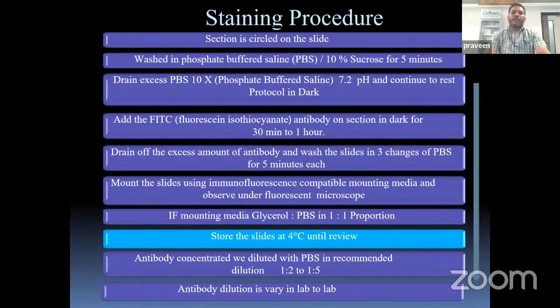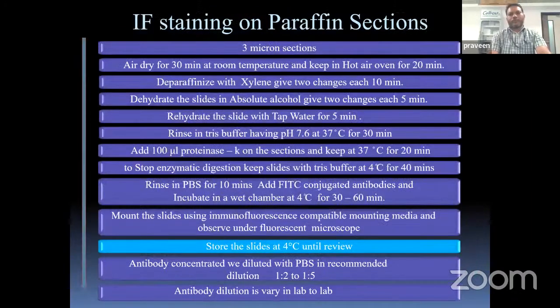Antibody is diluted with PBS in the recommended dilution provided by our vendor. Antibody dilution varies from lab to lab. We can also perform the immunofluorescence technique on paraffin-embedded tissue.